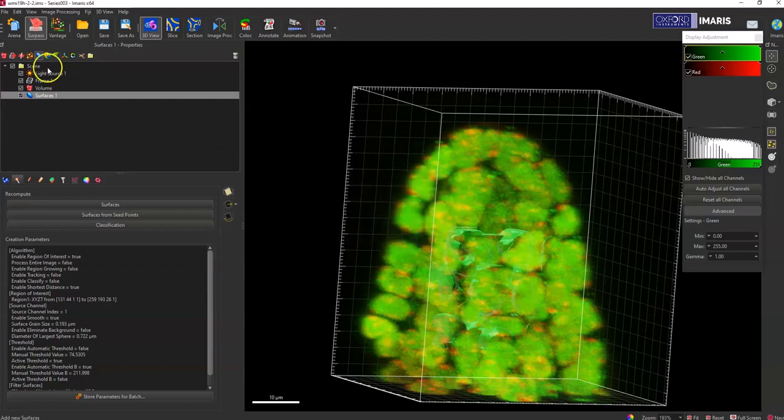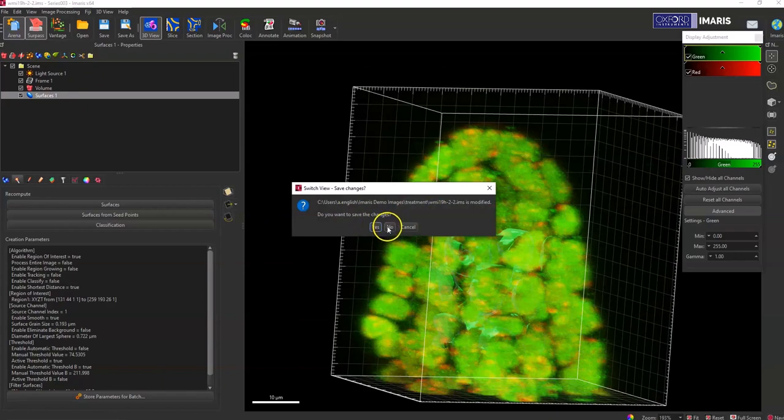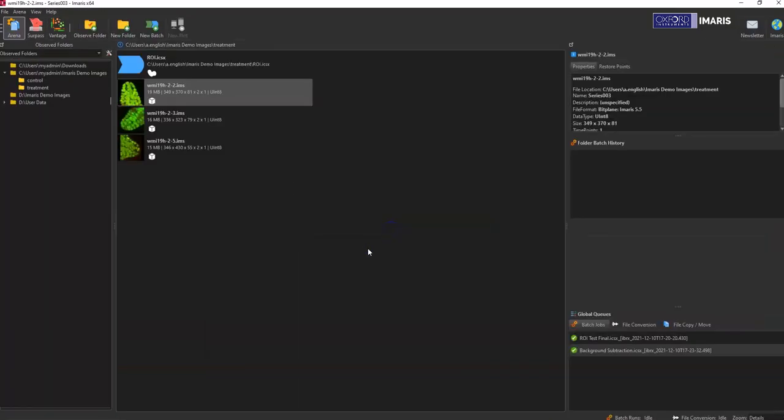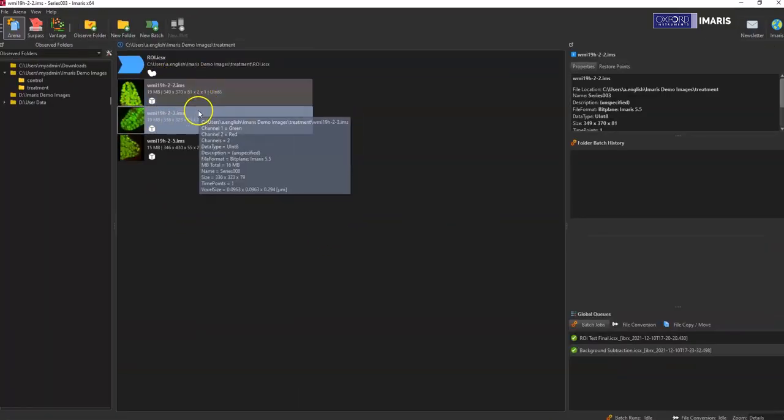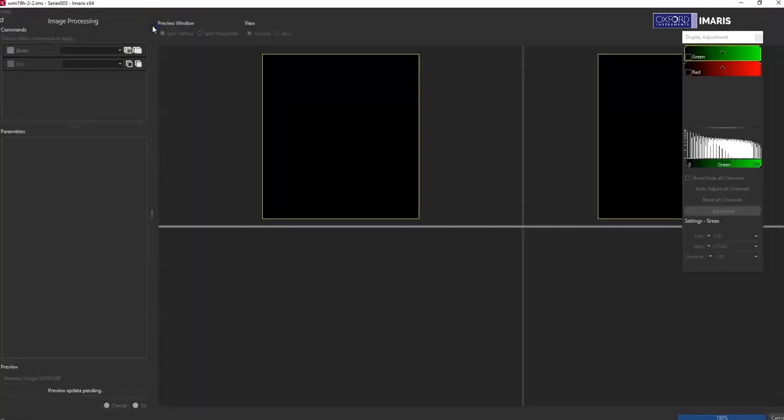And then once you're satisfied with that, you can go back to arena. You don't have to save what the image looks like. And then you want to create a new batch.